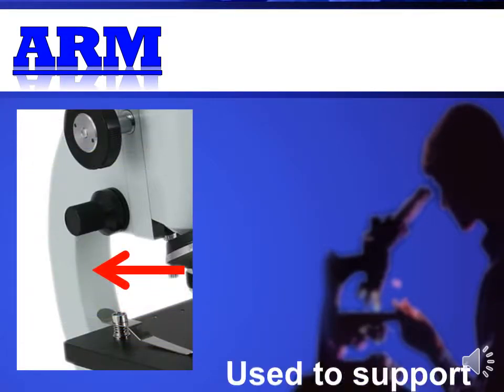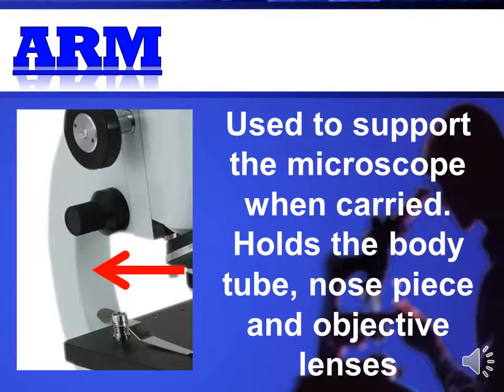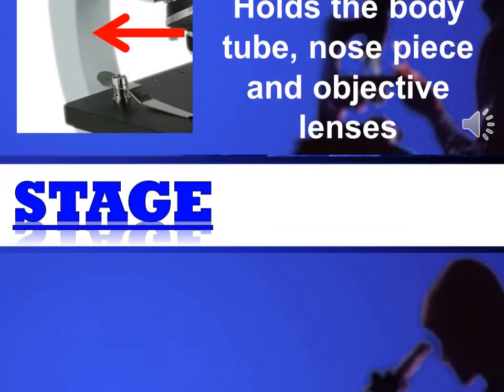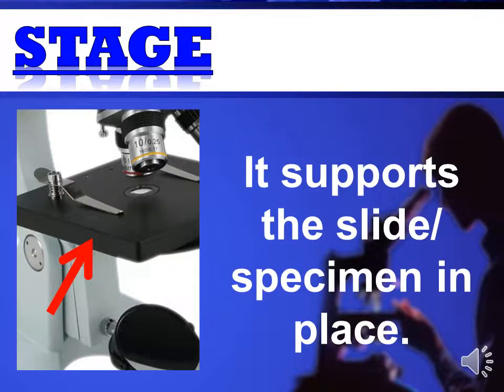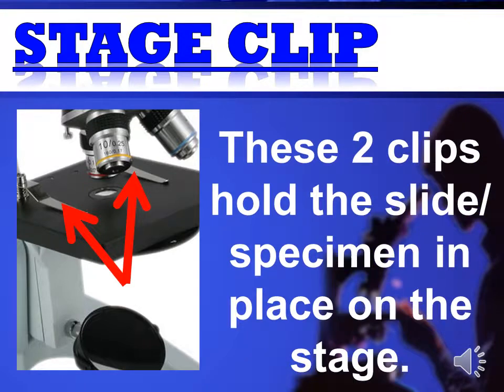Arm. It is used to support the microscope when carried. It holds the body tube, nosepiece and objective lenses. Stage. It supports the slide specimen in place. Stage clips are composed of 2 clips that hold the specimen slides in place on the stage.